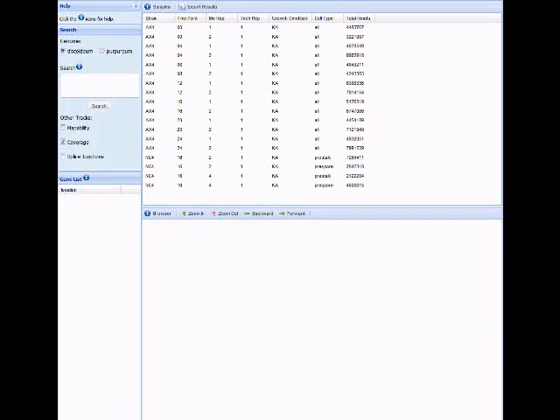Welcome. This is a brief tutorial on the transcriptome browser used to visualize RNA sequencing data from two Dictyostelium species.